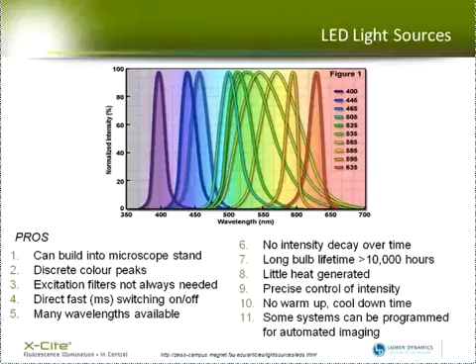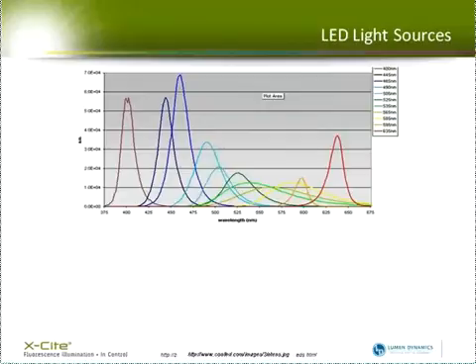There's no warm-up or cool-down time, so basically when they're turned on, they're at full power. And some systems can be programmed for automated imaging, so you could set it up to do 3 or 4 color time-lapse and walk away from the system. So there are some cons.